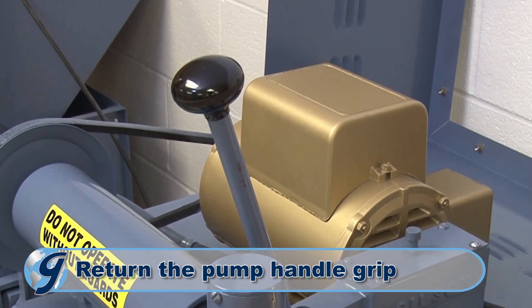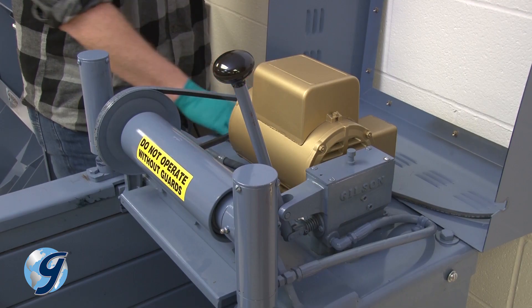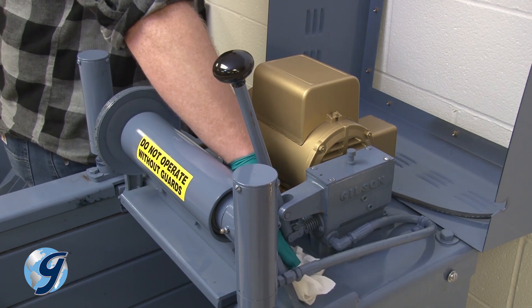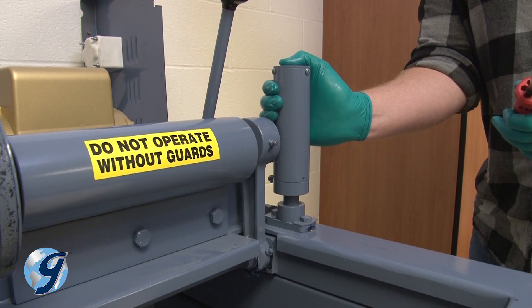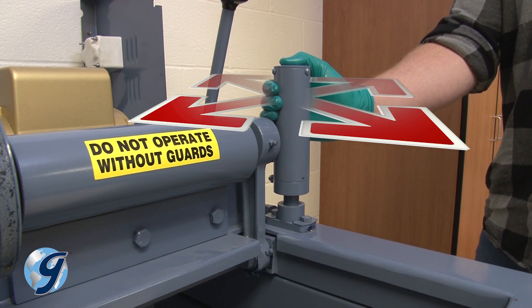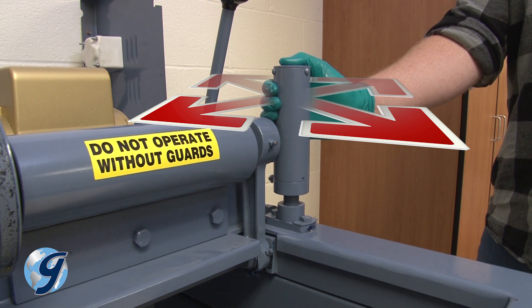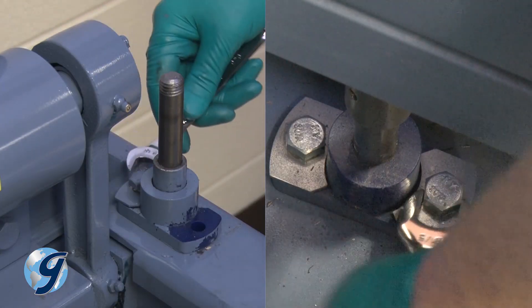Now, return the pump handle grip to the pump handle. Next, clean the interior of the unit to prevent foreign material from falling into the pump and contaminating the oil later. To check for wear in the guide bearings, apply pressure to the hydraulic cylinders with your hand, front to back and side to side. If a cylinder can move more than 1/30 of an inch in any direction, you should replace the guide bearings in the hydraulic clamp rod assembly.